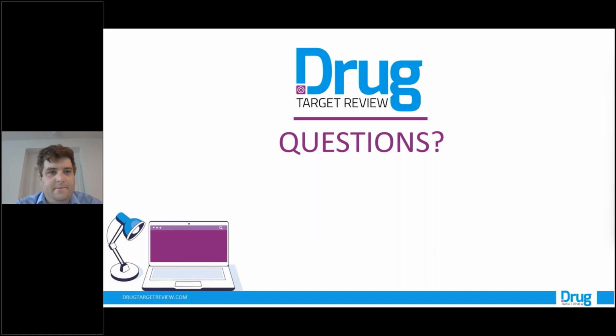Okay, thank you. So for this assay, is the KD of the test compound dependent on the affinity of the capture ligand to the SH2 domain? Right. As mentioned in my presentation, we do a bait load gradient during the assay optimization process.